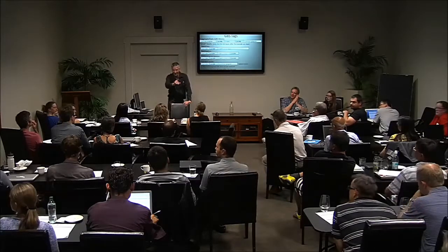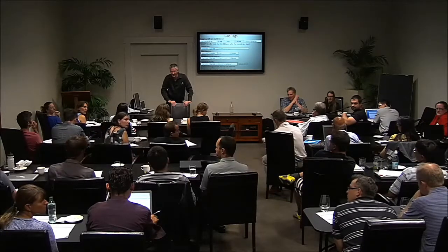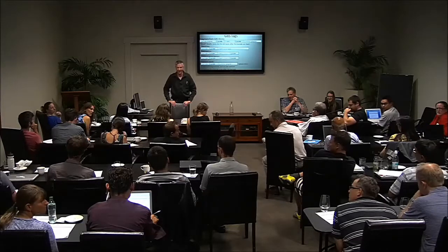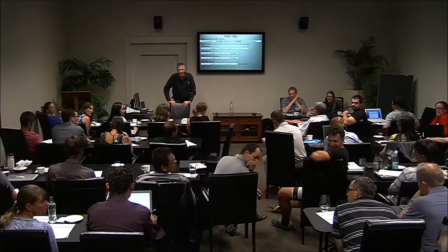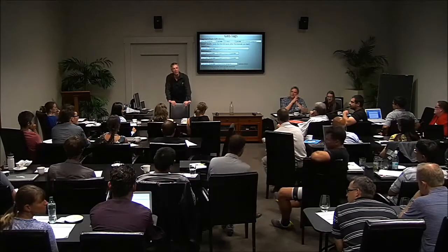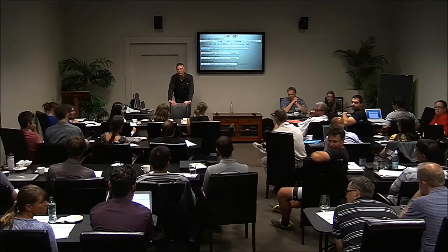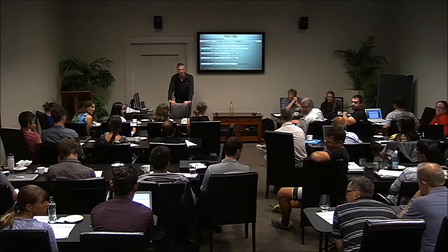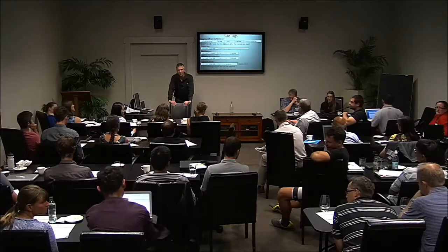Which is way more than... Speaking, because we've sequenced the genome back when next generation sequencing was pretty crap, and we were looking at a lot around 20, 30, 40 reads, if you have one mismatch in 20 or 30 base pairs, you won't actually be able to map it accurately onto the genome in the first place. So it would fail at the alignment step. Right. You really need for mammalian type genomes, that's diversity and everything else, you really need 50 or 60 bases minimum to do a good job with the alignments, minimum.